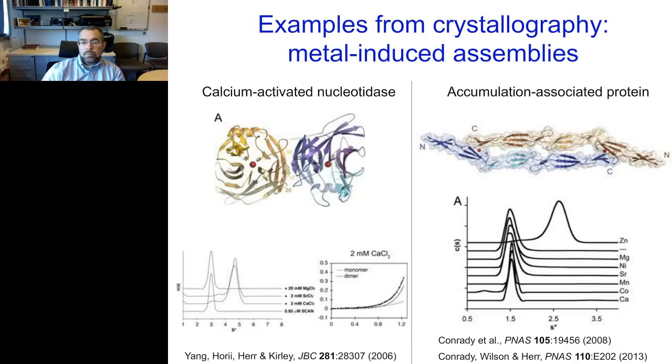But really the important experiment was quite a bit earlier when Kristen and Deb did the sedimentation experiment, and they found that this protein is a monomer in most cases, shown here. But in the presence of zinc, we get this pronounced shift to the dimeric form. And that turns out to be critical for the formation of these staph biofilms.